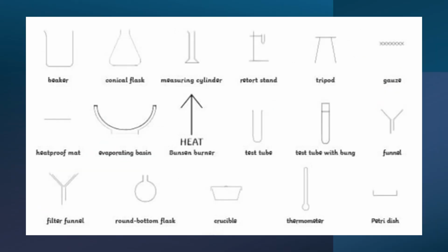However, when you draw this equipment, apparatus, or instrument in the lab book, you have to follow a specific drawing type, right? So in your exercise book, you are drawing. Normally drawing should be in pencil. In the lab when you are doing an experiment it's three-dimensional, but you need to convert it into two-dimensional. What does two-dimensional mean? Flat or line diagrams with labels for each piece.